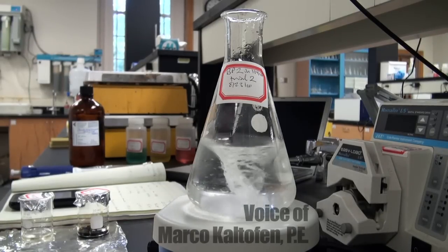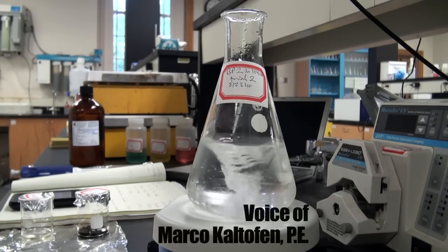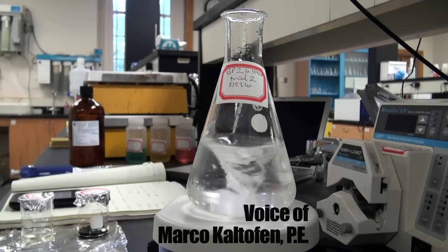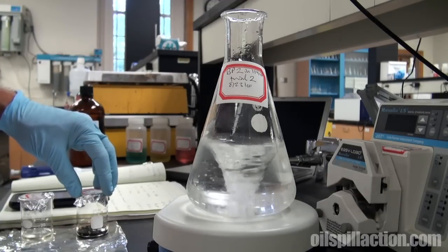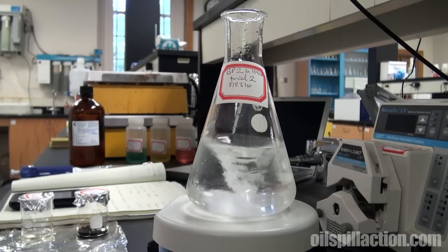We are in the Water Quality Laboratory at the Department of Civil and Environmental Engineering at Worcester Polytechnic Institute. Right now on the magnetic stirrer, I've got a bottle of clean seawater collected from the Florida Keys just a couple of weeks ago.